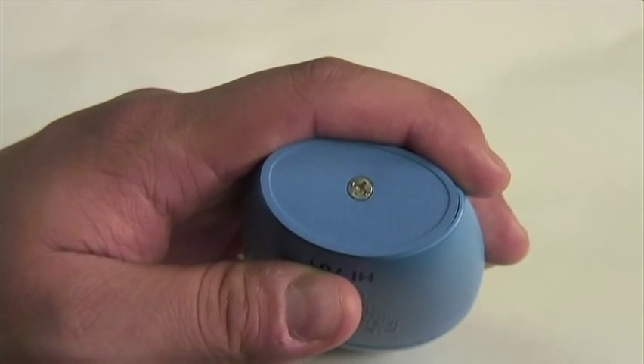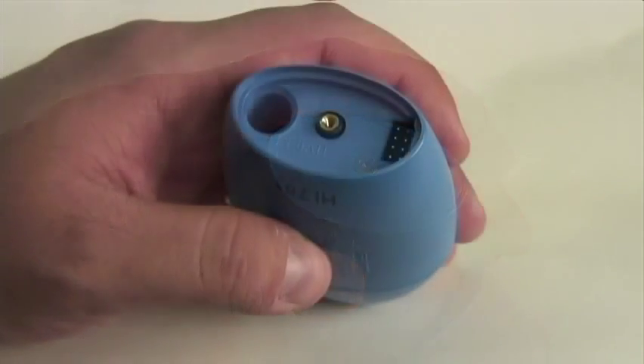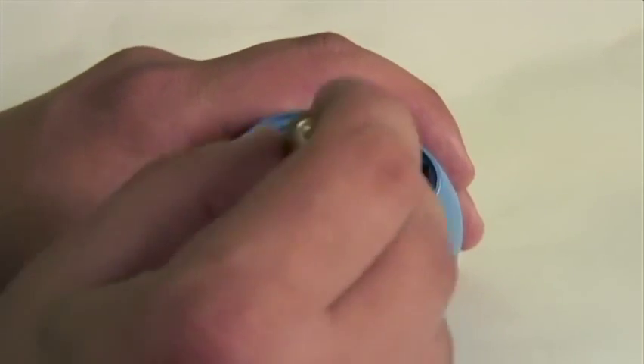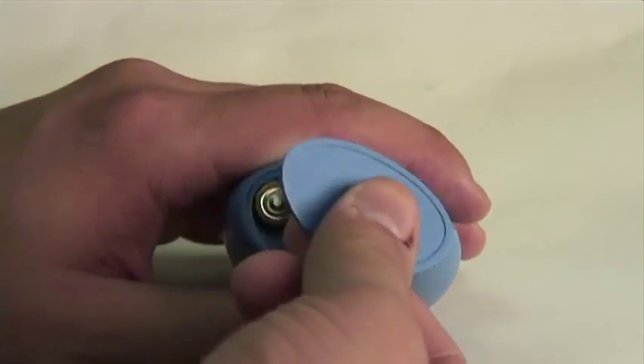On the bottom of the checker, you'll find a screw. This accesses the battery compartment, and this is where you're going to install the battery that comes with the meter. After removing the cover, you're going to insert the battery, making sure that the positive terminal is up, and then just reapply the case cover.